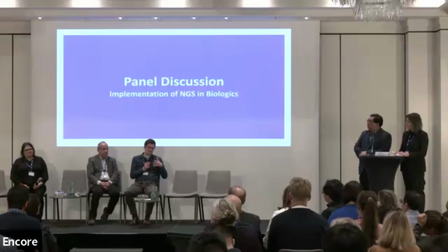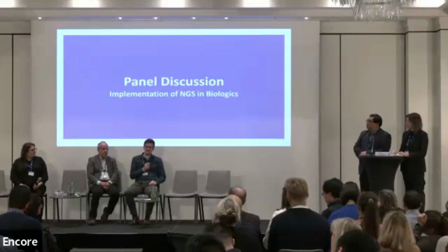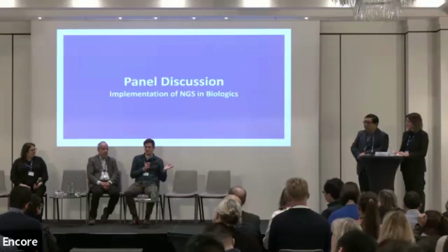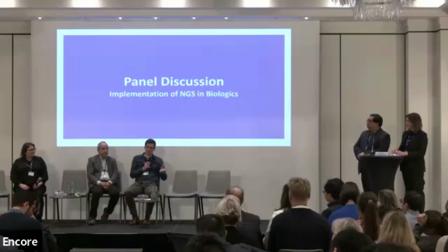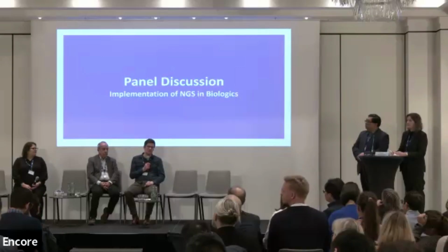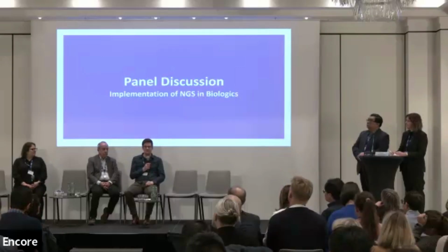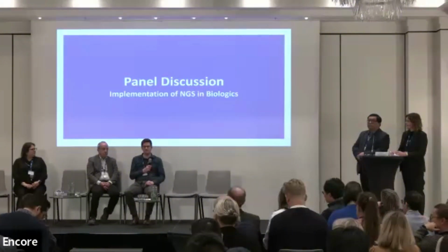But I do think it's a good idea for us to look into taking those unclassified reads and moving them also to the qualification step, and then see if read mapping detects it. But if it's really not in the database, then I think it's likely we would also not detect it there, because my experience is that it's still pretty close given the diversity that we have in the database. Yeah, it's a valid point.